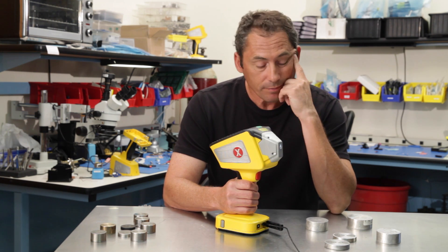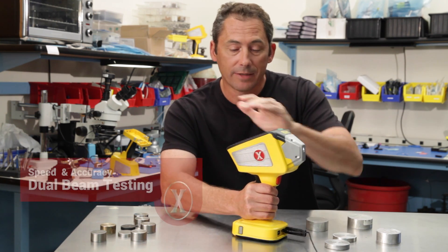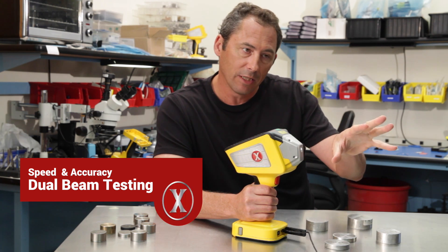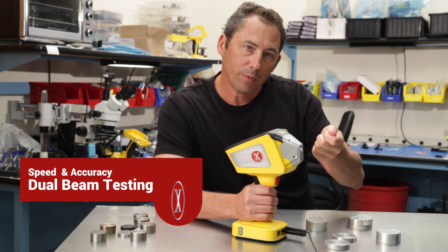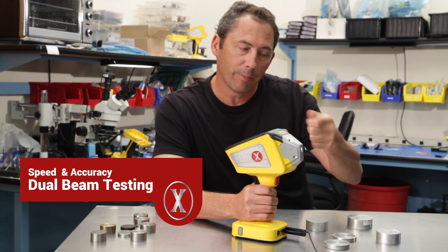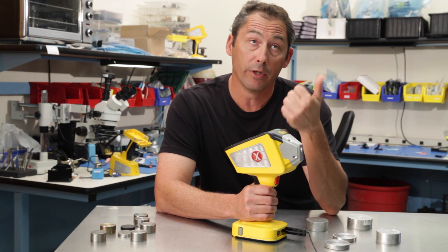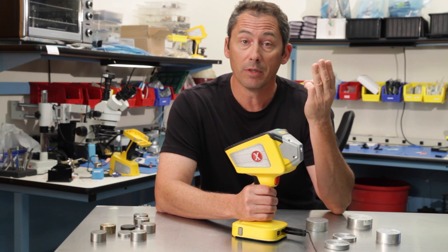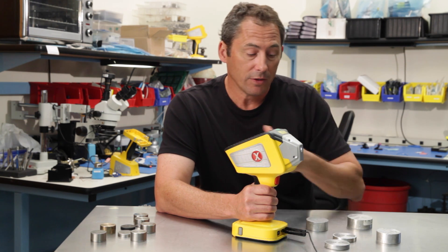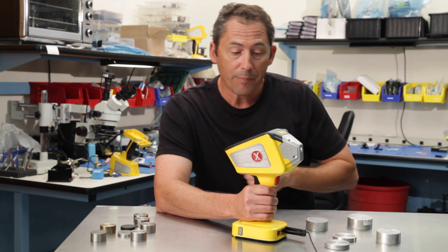Today I'm going to show you some aluminum alloys. We've now released the two-beam testing: X-ray shoots with one beam to get most of the elements, then flips to a new tube setting using high-speed shutters and filter wheels. We flip to that new setting very quickly and then measure aluminum, silicon, magnesium, phosphorus, and sulfur in that second beam. We'll show you how fast this thing has really become compared to the other X-ray units on the market.